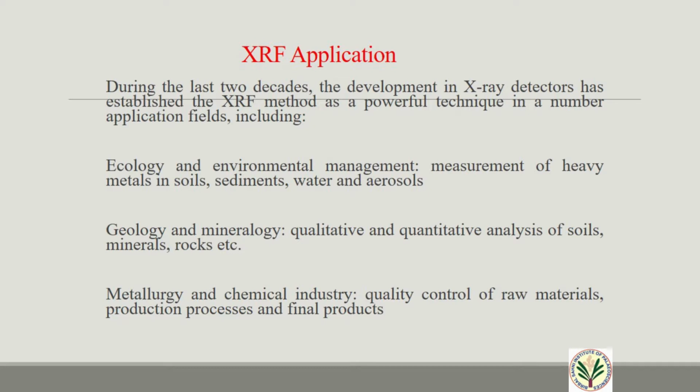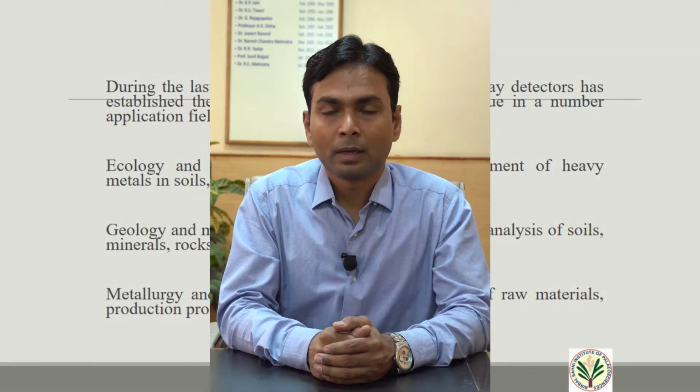Lastly, in earth science, the data generated by X-ray fluorescence in the form of major oxides and trace elements can be used to interpret earth surface processes, sediment-rock interaction, and weathering intensities. Certain geochemical indices help reconstruct provenance studies, past climate, past rainfall, and others, which are also applicable in the earth sciences.